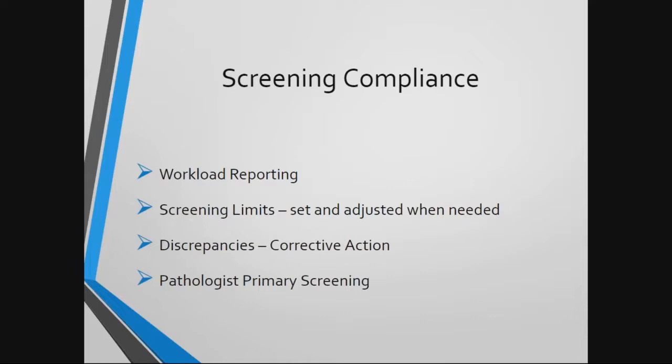And then finally, while we don't see it a whole lot, and we don't do it at our facility, anytime the pathologist does any primary screening, that workload must also be recorded following that same process as your cytotechs do.